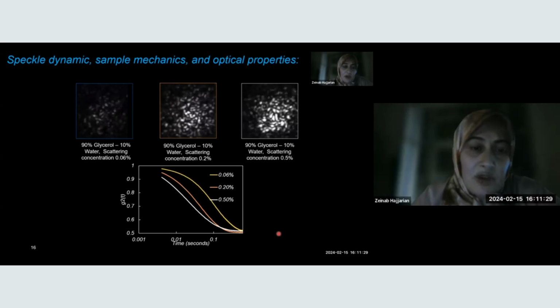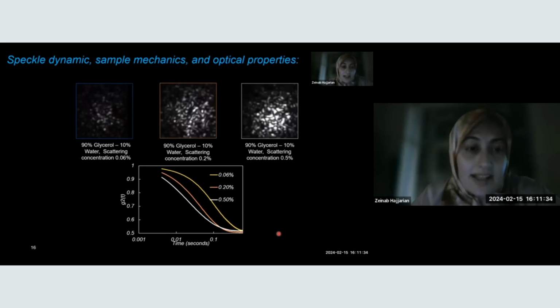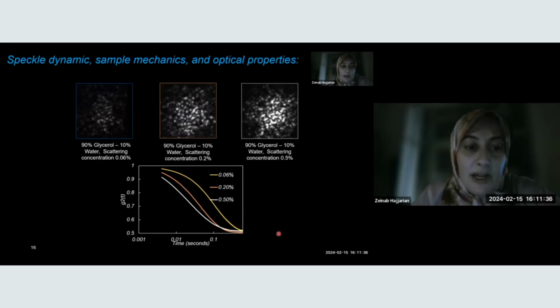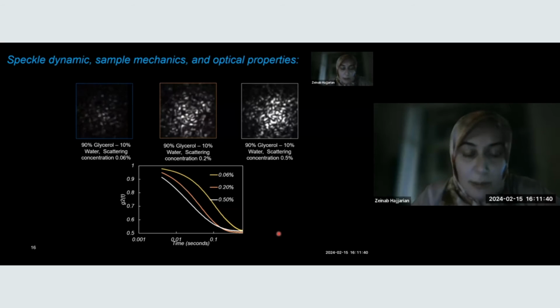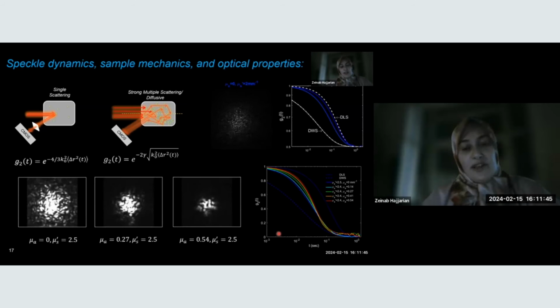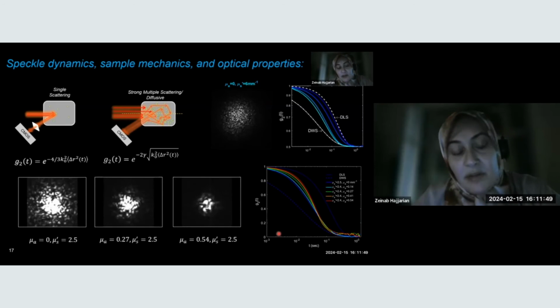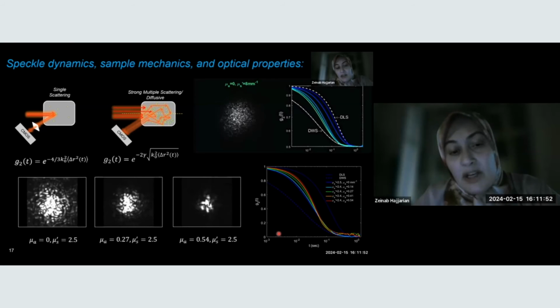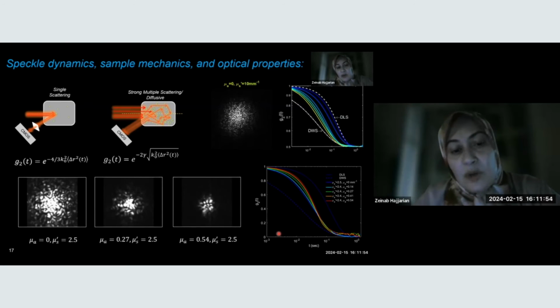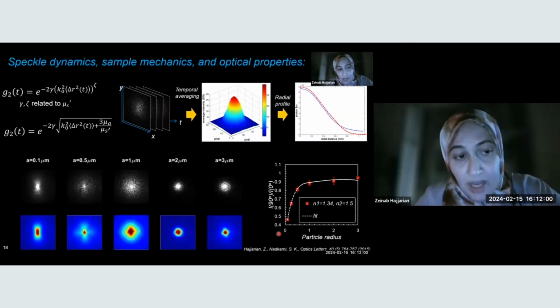But obviously, even by visual inspection of the speckle signal, you can tell that there's a significant difference in the scattering properties of the first and third sample here. So there should be a way to extract the optical properties from the same speckle signal. The other observation is that if we increase the amount of absorption in the sample, the rate of speckle fluctuations is going to slow down, because absorption is going to prune some of the longer optical paths that involve faster speckle fluctuations.